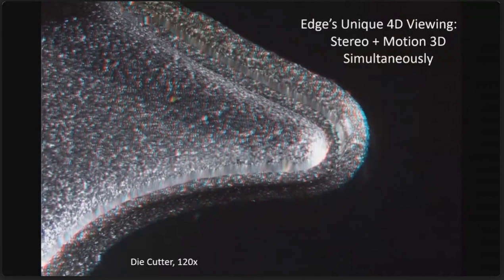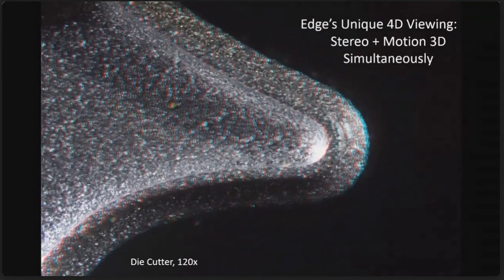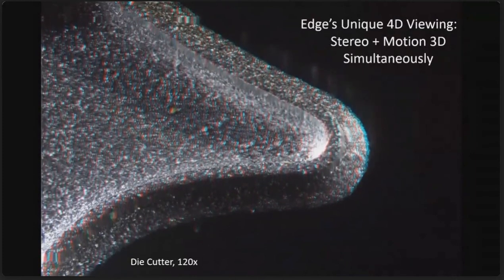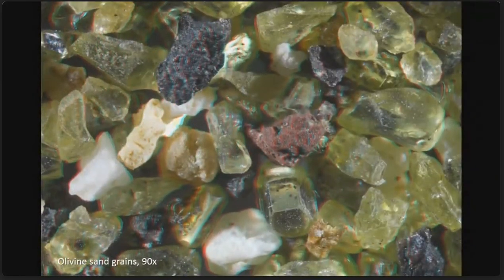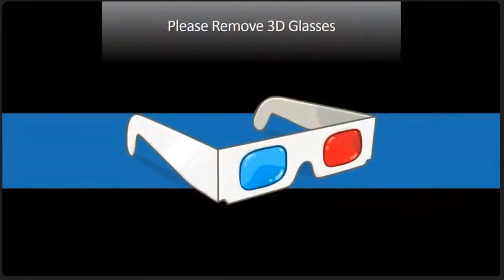Now, the stereo is interrogating the specimen from the left and right view, whereas the tilting is interrogating the specimen up and down view. So now you're getting a much more accurate view of what's happening, what we call 4D viewing. And here's another 4D image. You're getting the stereo view if you have your glasses on, yet you're also getting the motion view at the same time, which gives you more information.